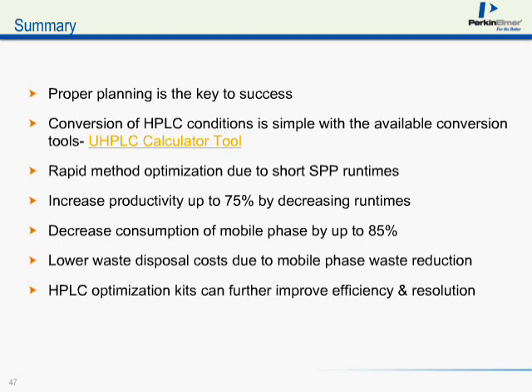Yes, Julie, of course. One thing is the SPP columns are going to last a lot longer than the sub 2 micron particle size columns. I've done some studies here in this lab where I've gotten over 3,000 to 4,000 injections on a single column. And so that'll definitely help improve your lifetimes. Of course, you always want to be careful to make sure that you filter your samples carefully and filter your mobile phases. And you can still use the calculator. The calculator is independent of the system you have. And so all you need to do is get the calculator and have an SPP system.